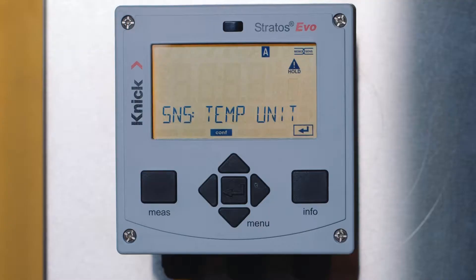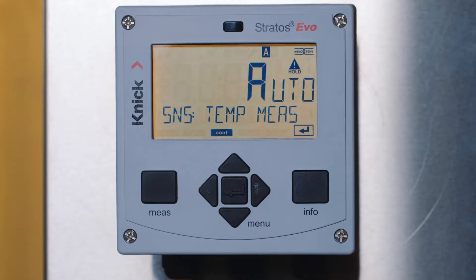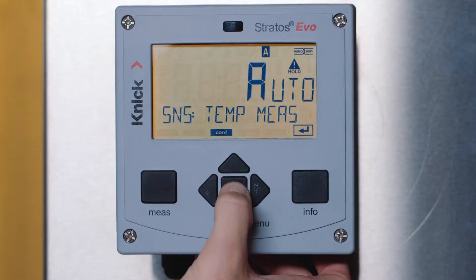The next parameter is the setting for temperature display. We will select Fahrenheit and press enter. This is followed by the type of temperature measurement — automatic or manual — along with the temperature calibration method. We will select Auto for both to ensure that temperature is automatically compensated when making the measurement.